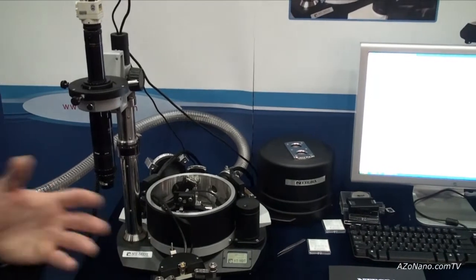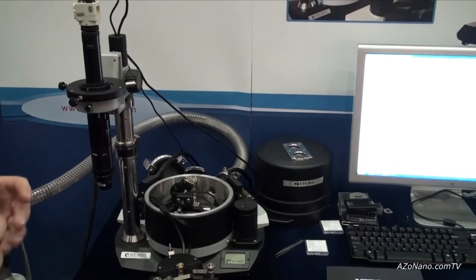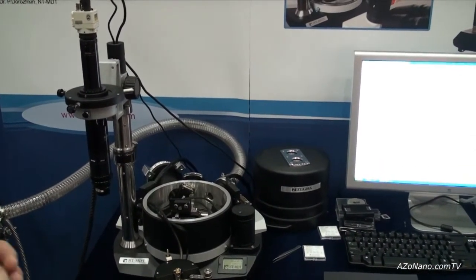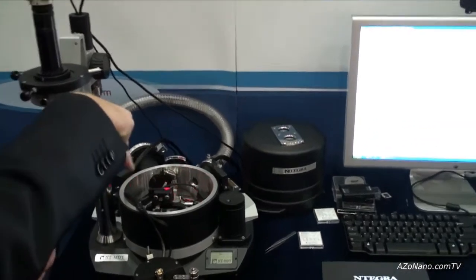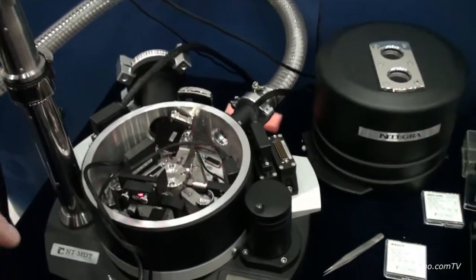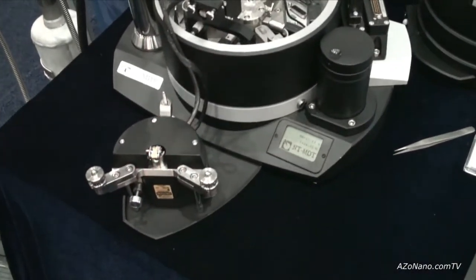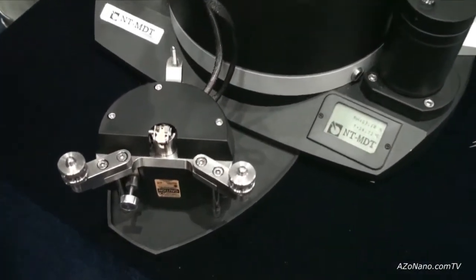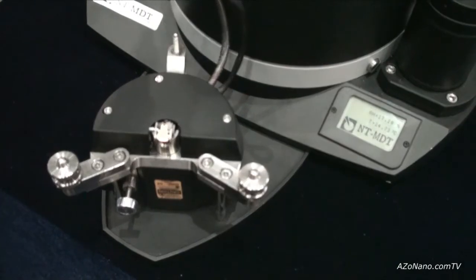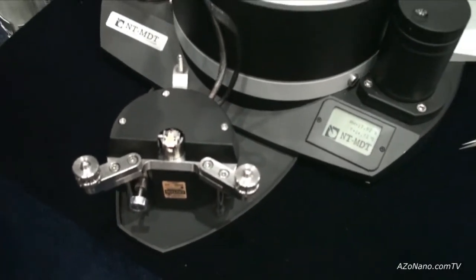You may ask how this is possible, and that's the purpose of my introduction. You see, the system contains a scanner from the bottom and a scanner from the top. It has a double scanner system which allows us to use both high resolution and large sample images.